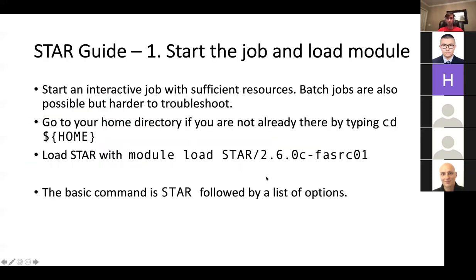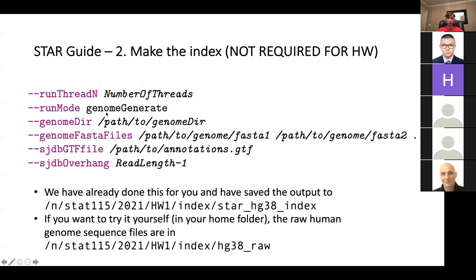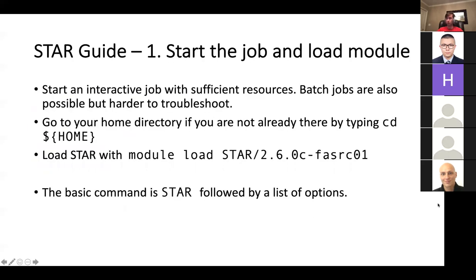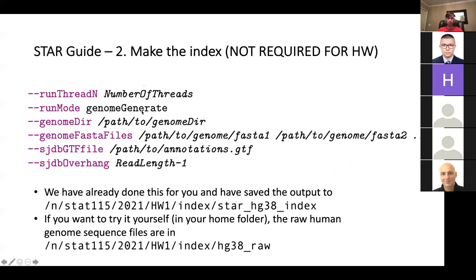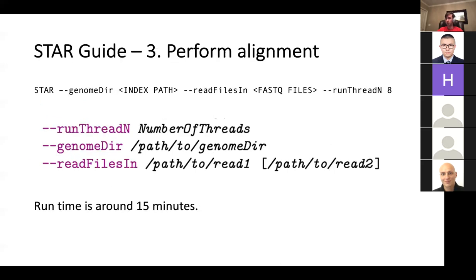What I meant is that the basic command to do anything in STAR is just 'star', followed by options. If you want to do runMode genomeGenerate, you type 'star --runMode genomeGenerate'. If instead you just want to do alignment, you type 'star' — the default mode is alignment, so you don't have to say anything extra, but you just have to specify where the index is and where your FASTQ files are.